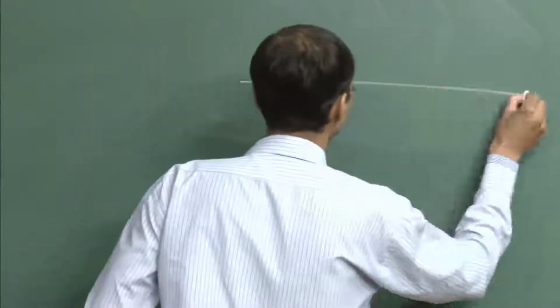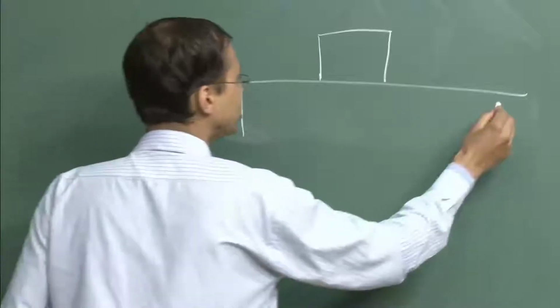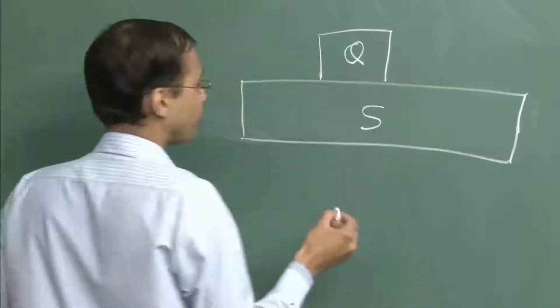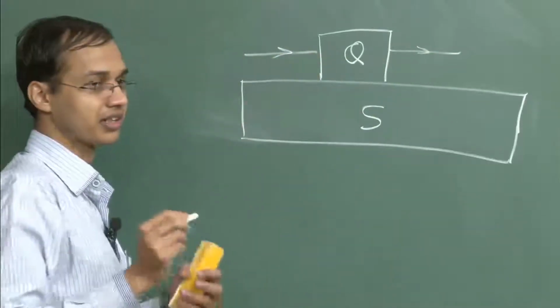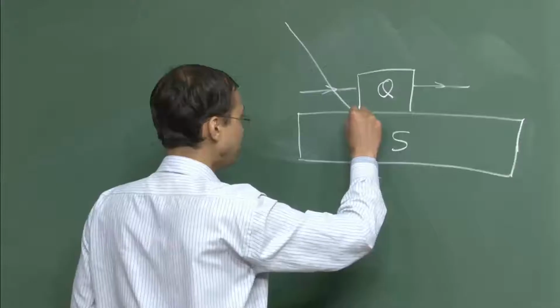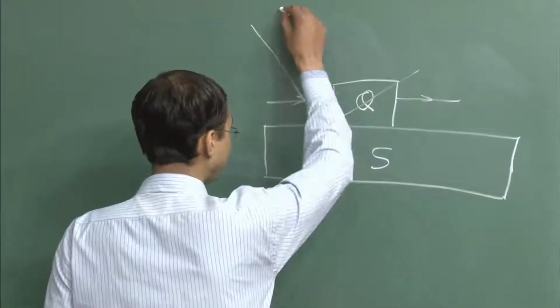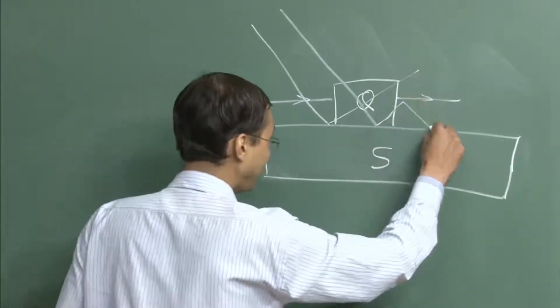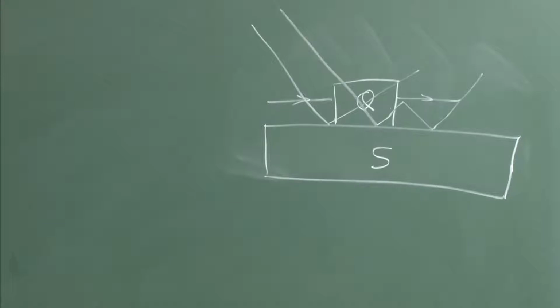Okay, so let us go back and have a look at what exactly can happen in this geometry. This is a substrate, right, and say this is something like a quantum dot. The Born approximation essentially talks about a single scattering event, single kinematic scattering. However, in this case, we can have a situation where the beam gets first reflected from the substrate, and then it gets scattered, or it can get scattered through this one, through your substrate, and then again get reflected, right. So all these multiple scattering events can occur in the grazing incidence geometry.